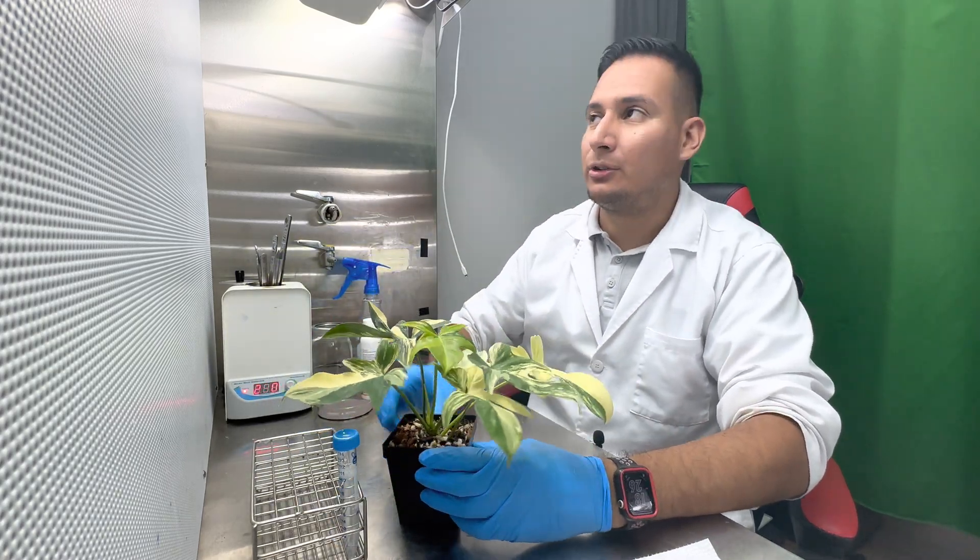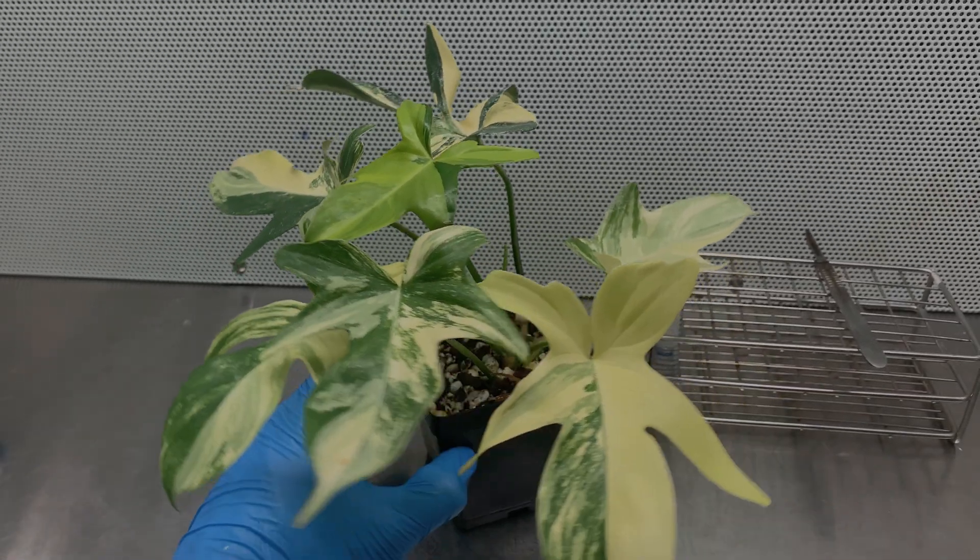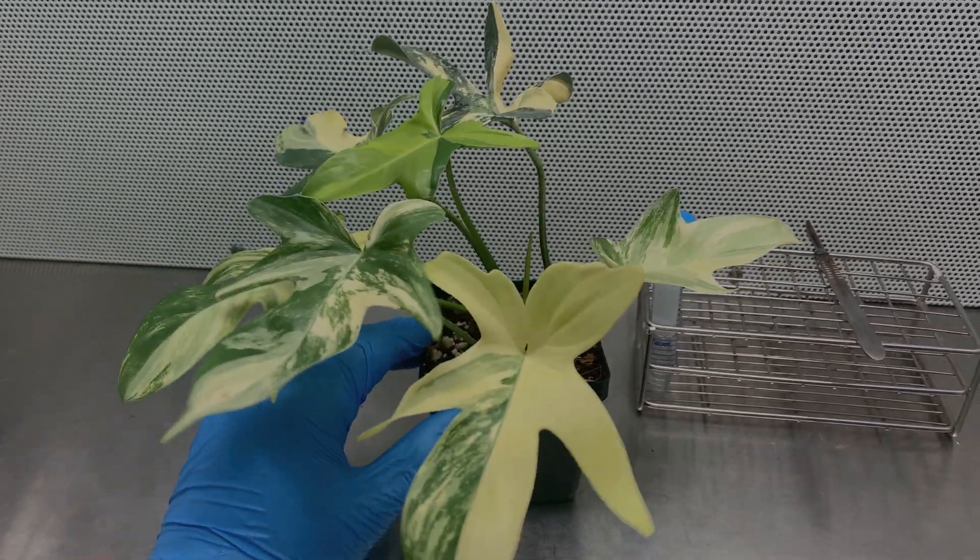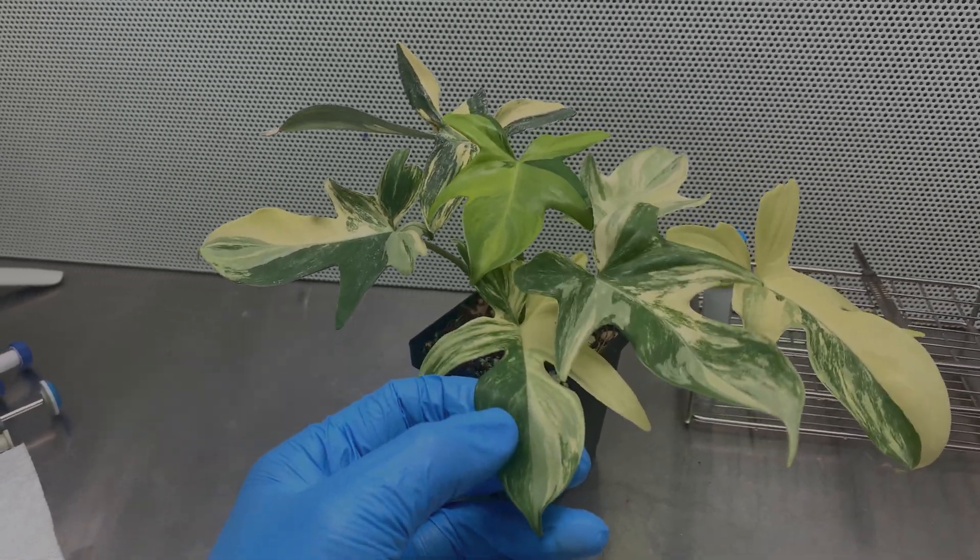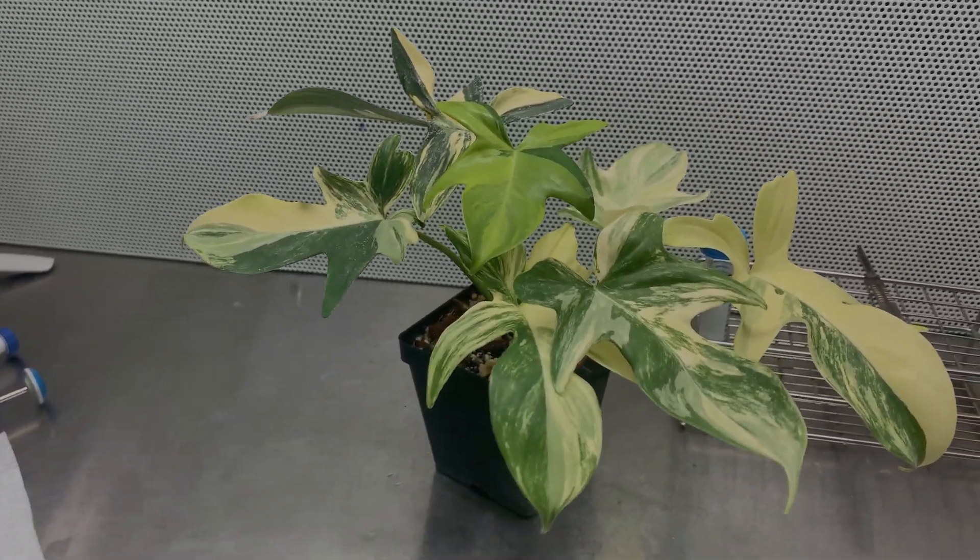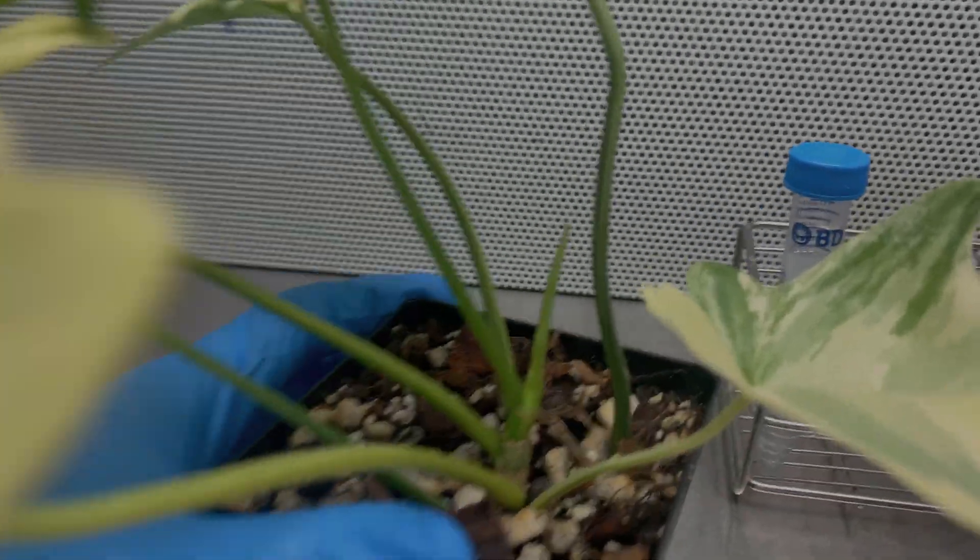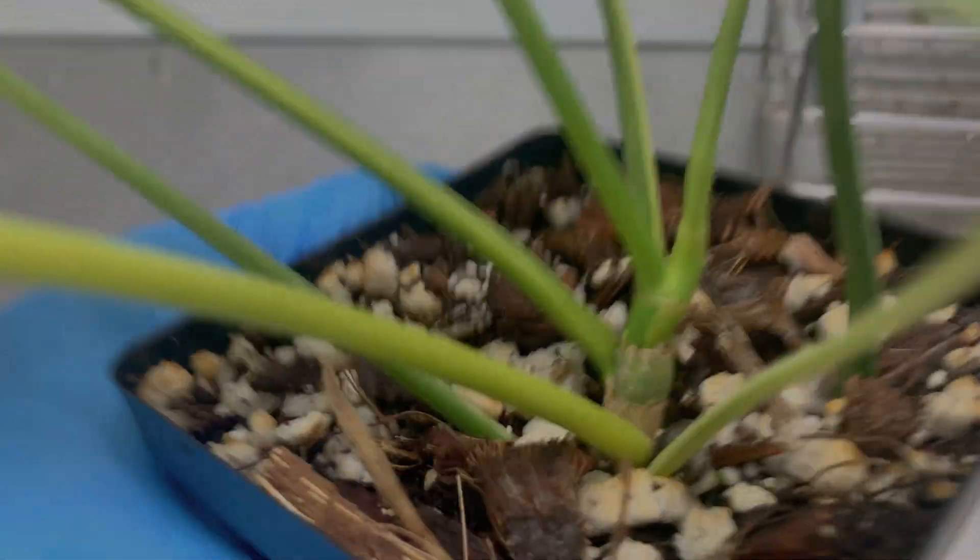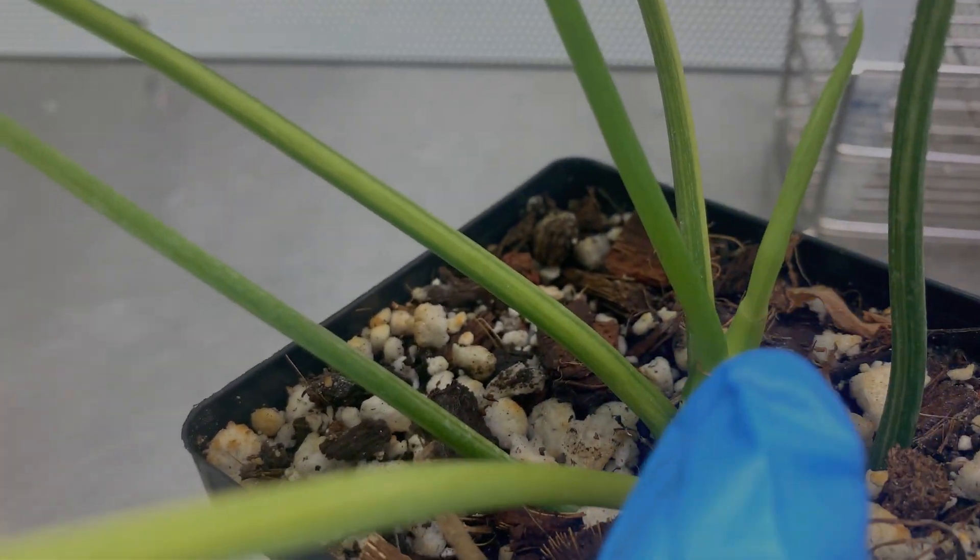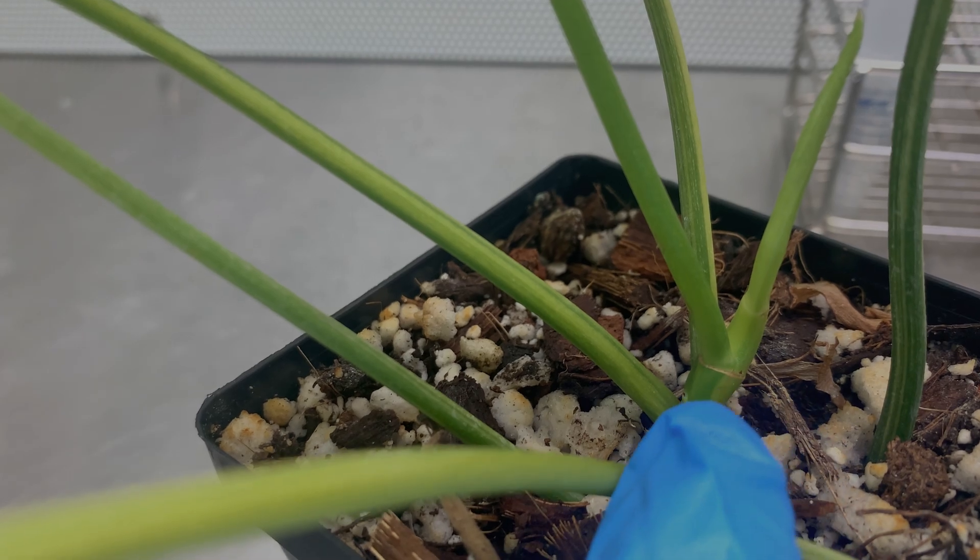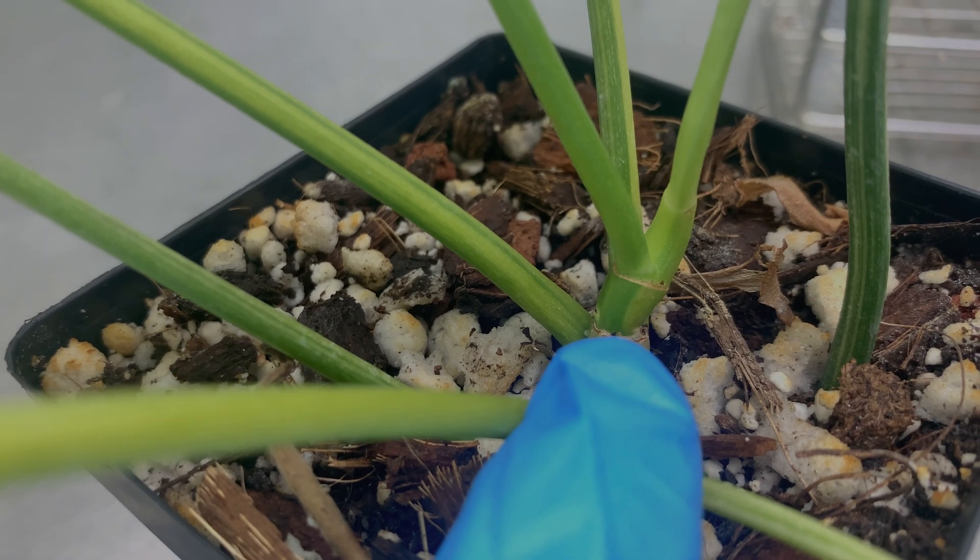With tissue culture, in theory you should be able to take any part of the plant and regenerate new ones. Unfortunately that's in theory, and in practice it's a lot more difficult. So I cannot use part of the leaf, I actually have to take a node. What I'm going to do is take this node right here. This is the new leaf coming up, and there's one node, two nodes, and you can see this tiny little right here, that's another node coming up.